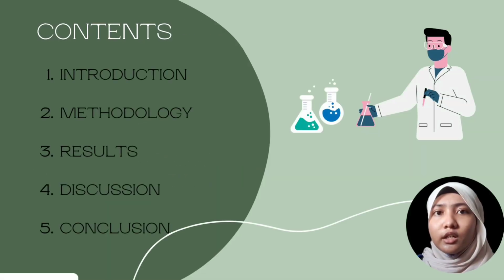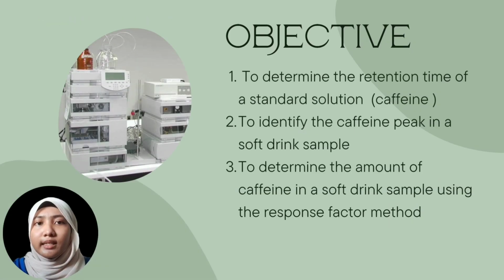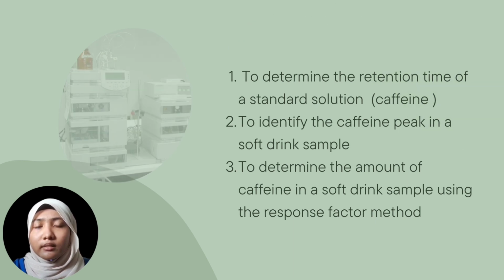For the contents of our presentation, we have introduction, methodology, results, discussions, and conclusions. The objective of the experiment in this presentation is, first, to determine the retention time of the standard solutions. Second, to identify the caffeine peak in a soft drink sample. Lastly, to determine the amount of caffeine in a soft drink sample using the response factor method.